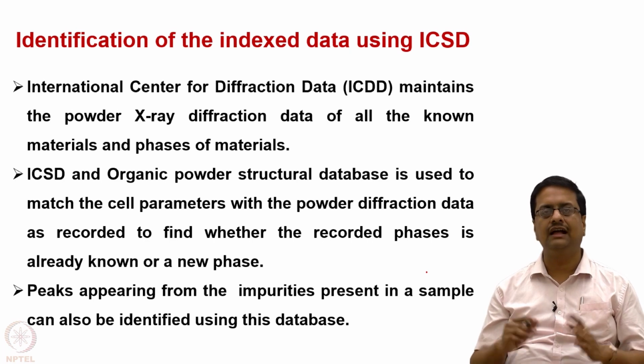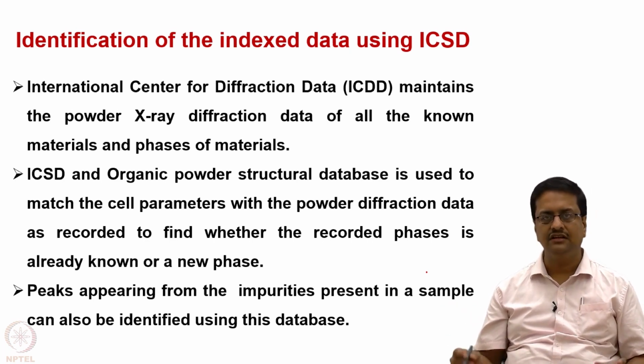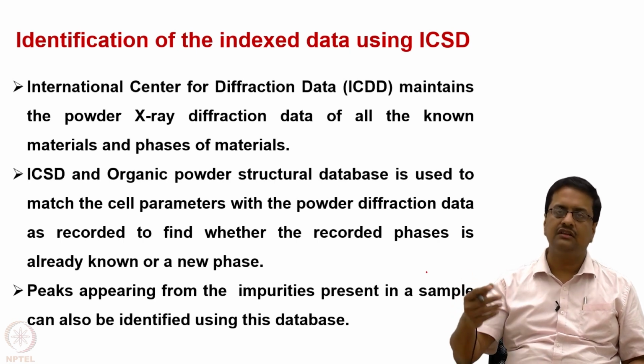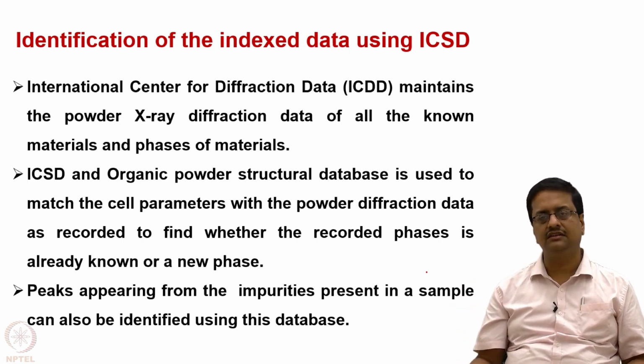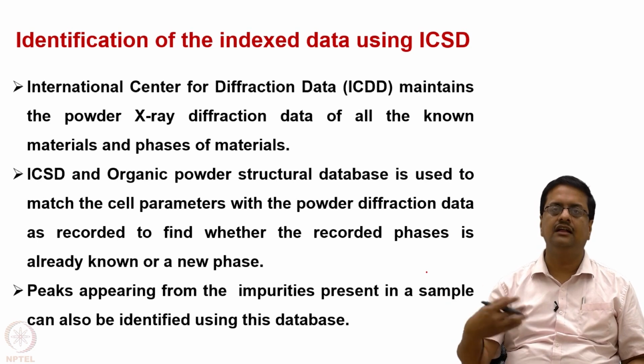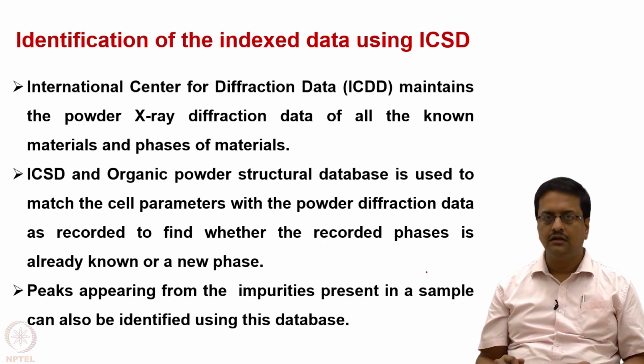So if one has access to this database, you can compare the powder pattern that one has generated with the already reported powder X-ray diffraction data, and then one can conclude that, okay, I have generated a previously known phase, or I have generated a new phase of that same material.